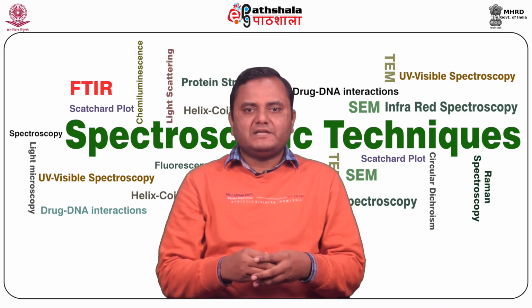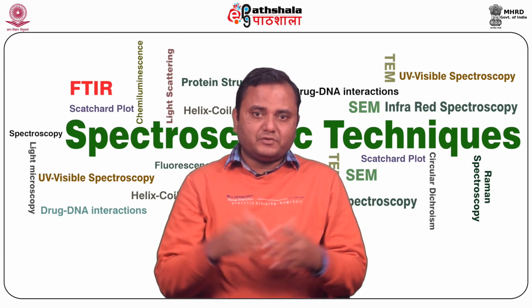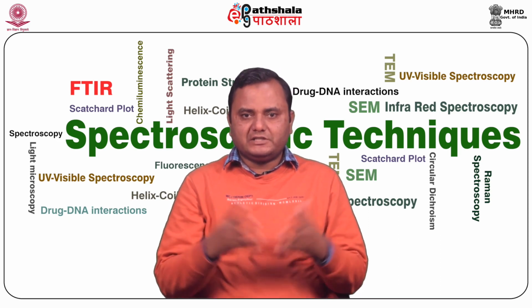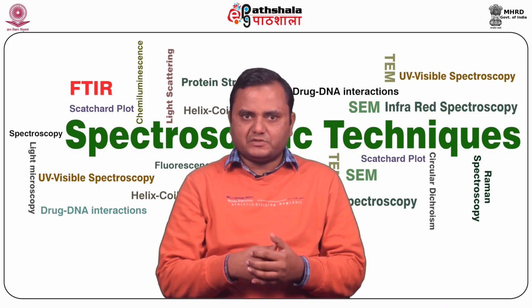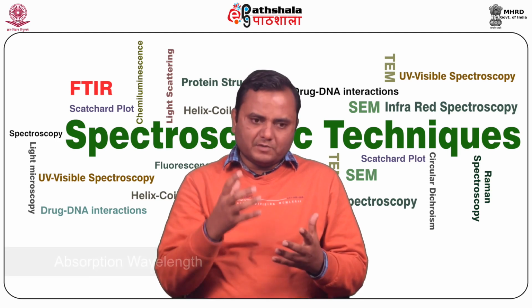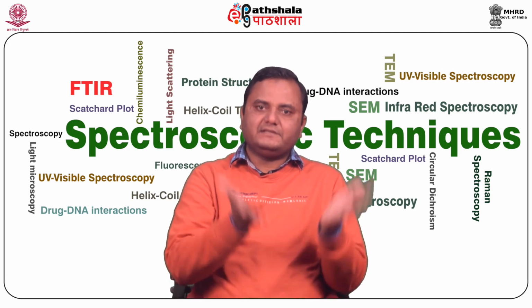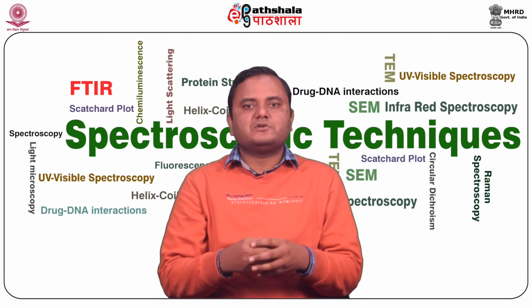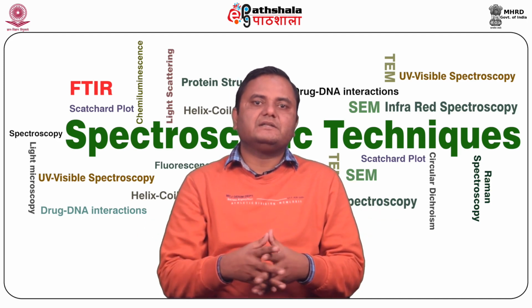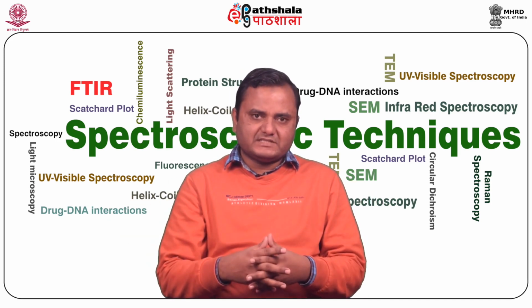So fluorescence is a relatively highly sensitive technique as compared to absorption spectroscopy, with a magnitude about 3 orders higher than absorption spectroscopy. It is generally measured by exciting a sample at its absorption wavelength, the wavelength at which the sample absorbs light and gets excited. This wavelength is also known as the excitation wavelength or absorption wavelength, and then the emission is measured at a slightly longer wavelength, called the emission wavelength.